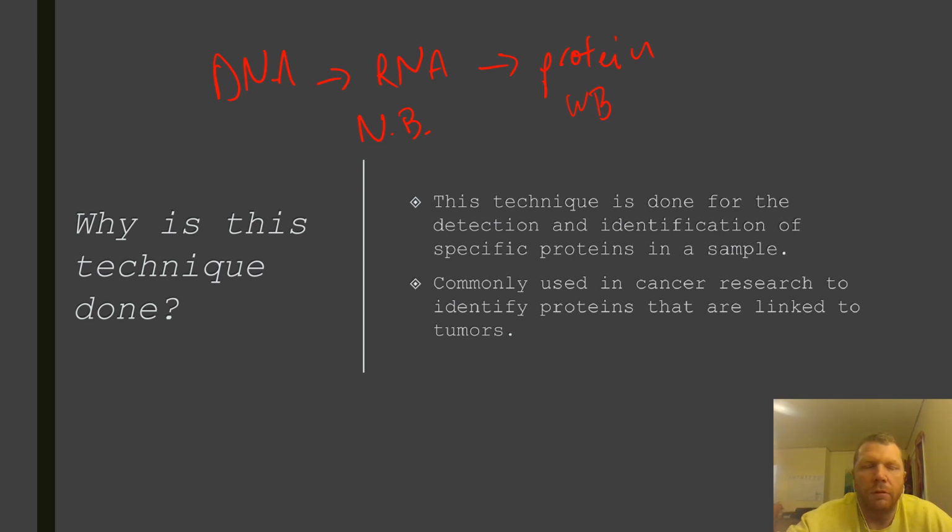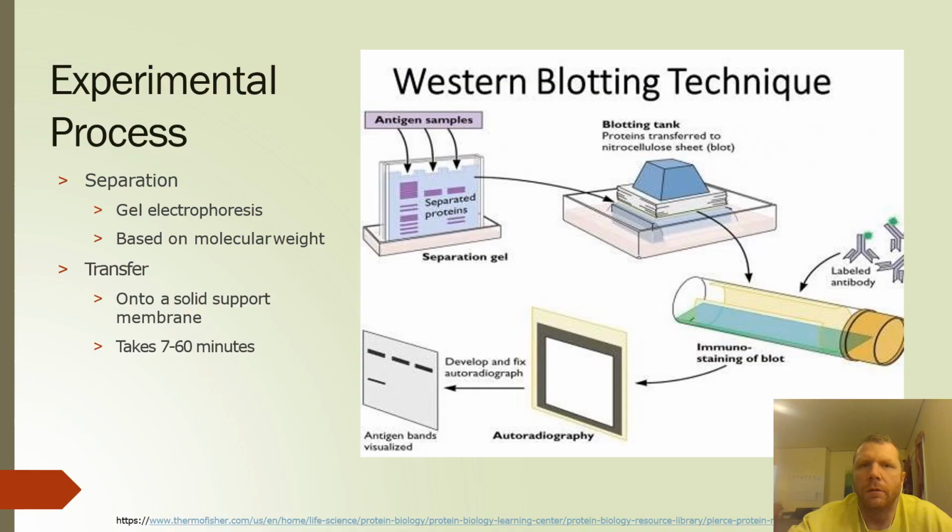So, if you're doing Western blot analyses of thousands of people with and without tumors, then you'd be able to draw correlations between presence of a protein product and whether or not someone has a particular type of cancer.